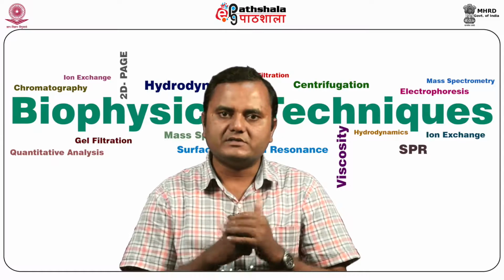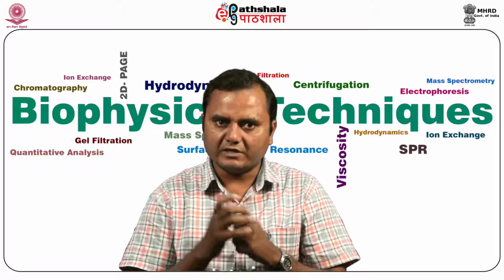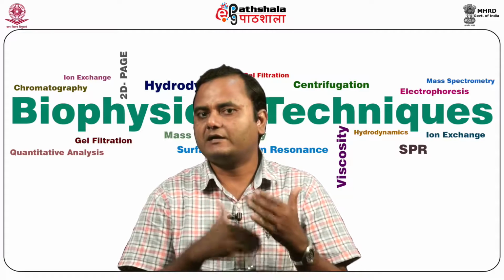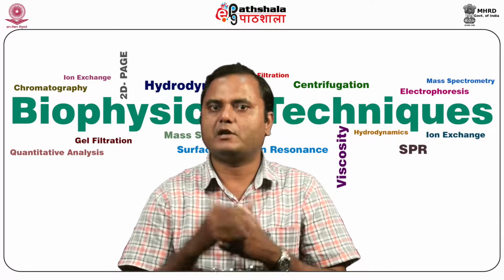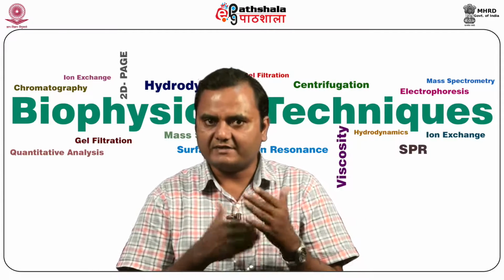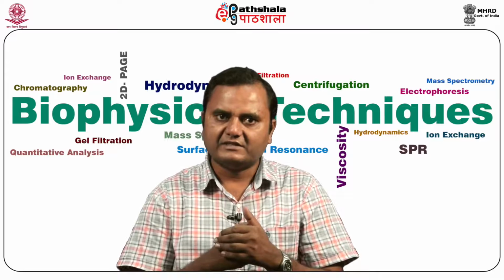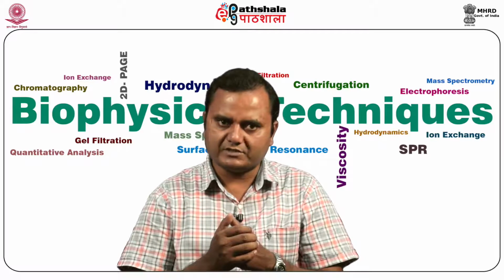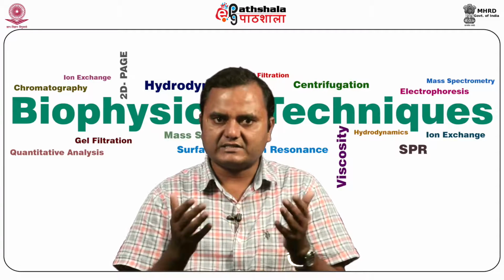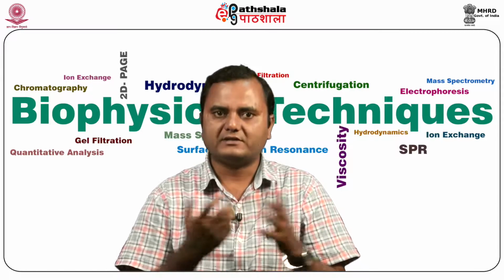Thus the S value is related to the molecular weight of the solute, and S equals molecular weight times 1 minus V rho divided by NF. This is another way to calculate in terms of the molecular weight. A correlation should be established between the molecular weight and the S value. It is given as S equals molecular weight times 1 minus V rho divided by NF, where V is the partial specific volume of the solute and rho is the density of the solvent. N is the Avogadro number, that is 6.023 times 10 to the power 23, and F is the frictional coefficient of the solute.